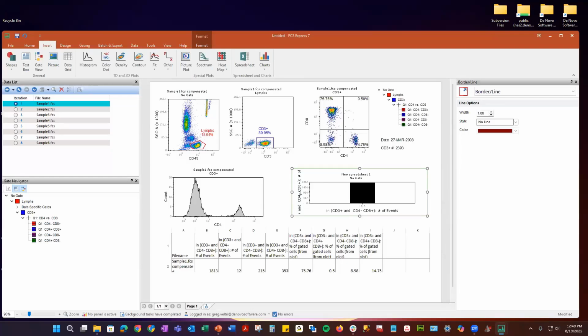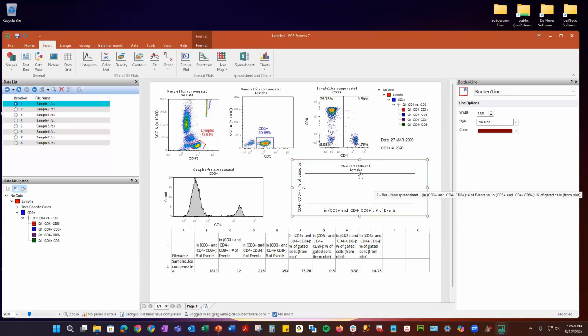So if I wanted to change that, same axes here, I can change all of that. I can change the format. I can change the color of it, etc. And I can make it however I want it to be, etc. So a lot of different things here. And you can see why when I first mentioned this, we kind of say to ourselves, how do I want to put my layout together? Or how do I want to present my story to someone about my data? That allows you to do that here.